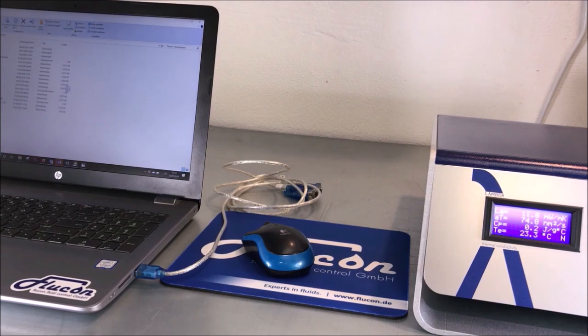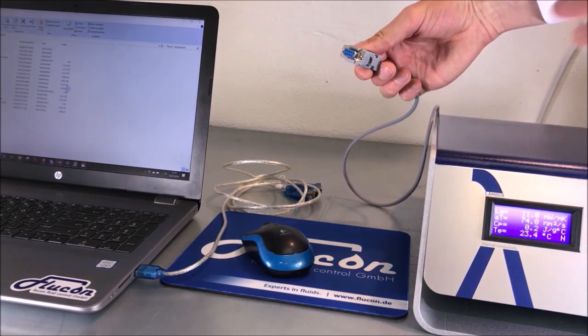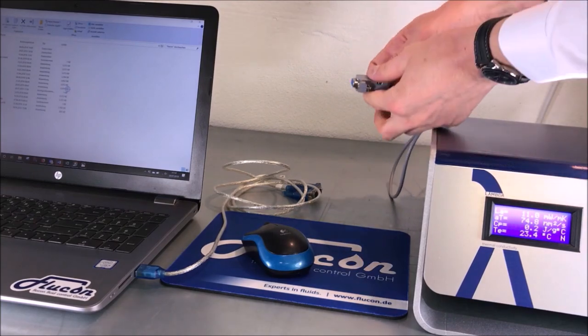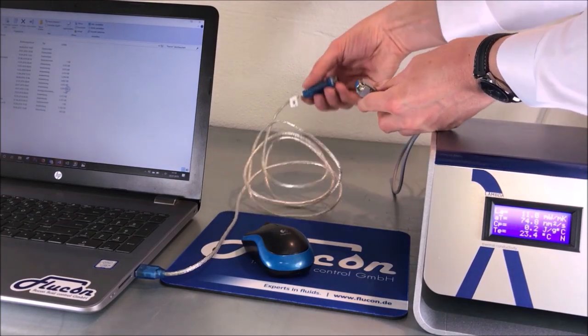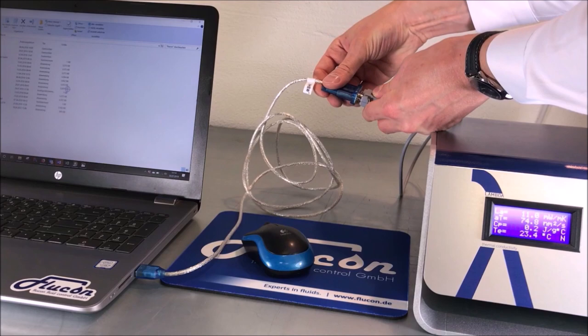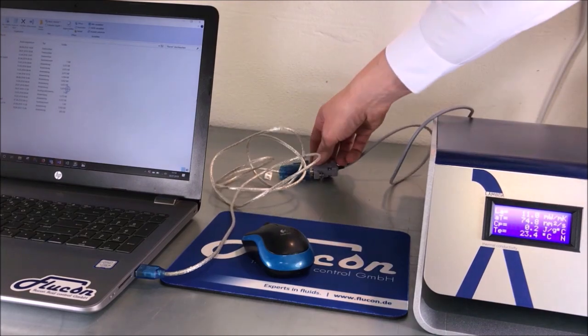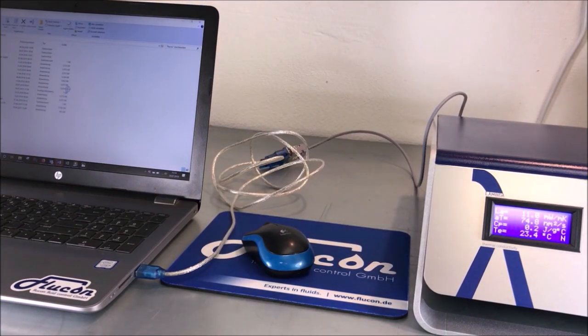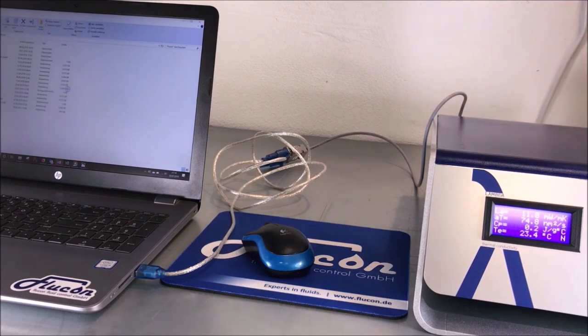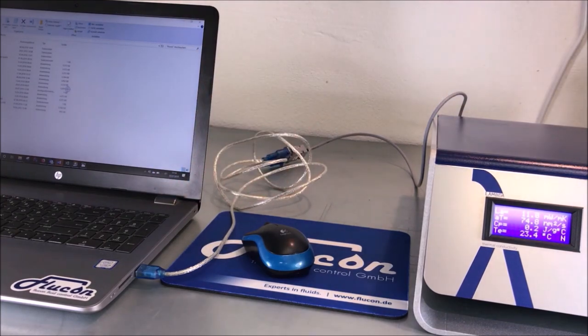You may want to check this by means of the device manager of your PC. Next, you connect the PC cable to your USB adapter. Now your Lambda meter is connected to your computer and you are ready to prepare for measurement.